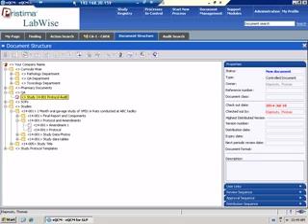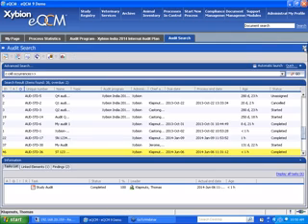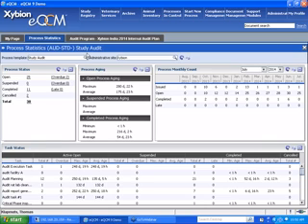A couple more features of the system is we have process statistics, which allows you to view all of your audits and their life cycle. And so here, by selecting the process template, which is study audit, and the site, so you can look at your various sites. If you're a global company, you have multiple locations. You can filter by site to show me all of the open audits, any suspended, completed, and canceled. So total is 38 audits.